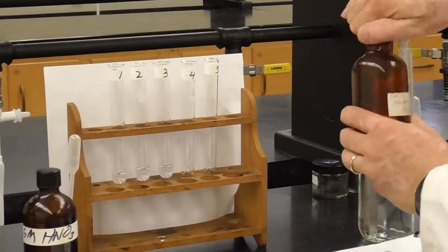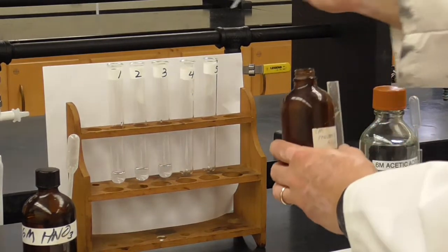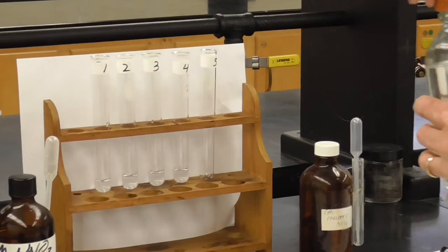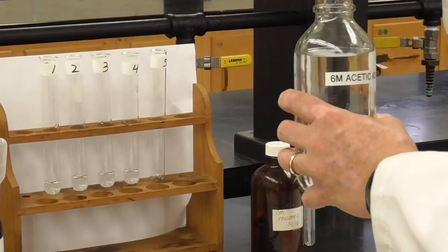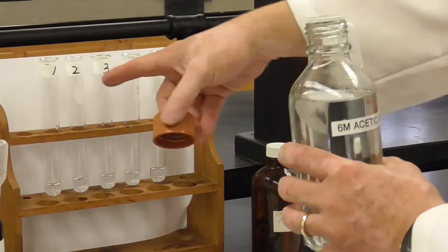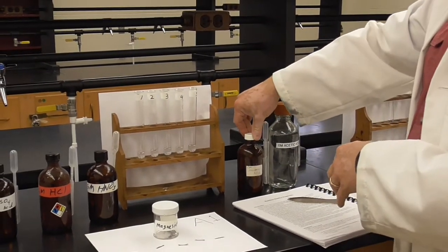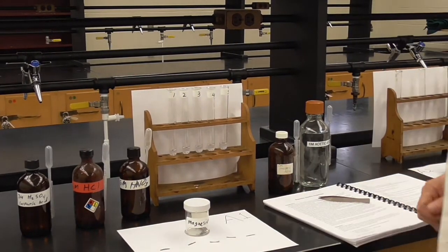Number 4 is phosphoric acid. 5 is acetic acid. Acetic acid is the stuff that's in pickle juice and vinegar, so it's got that real distinct smell to it. Hydrochloric acid, number 2, is the stuff that's in your stomach. These are very familiar acids, actually. Phosphoric acid you find in Coca-Cola. So, anyway, we've got our 5 different acids, and now the 5 different strips of magnesium.